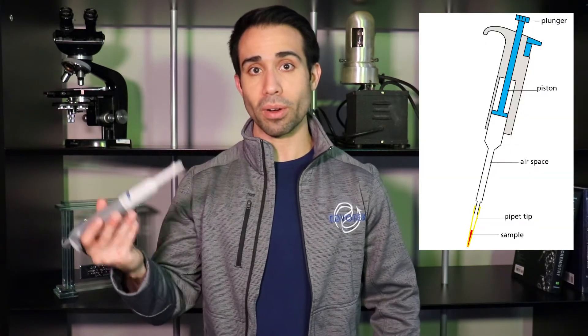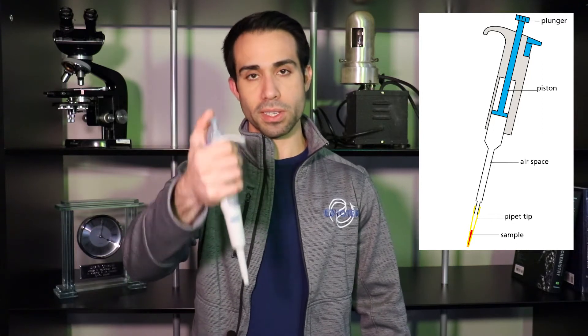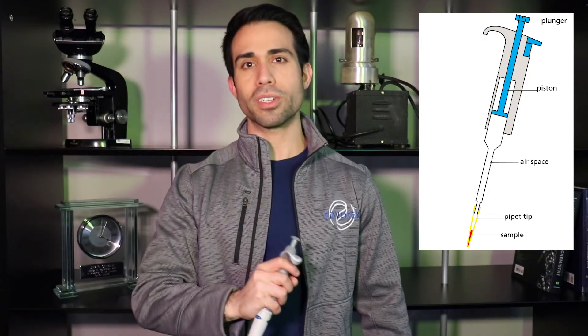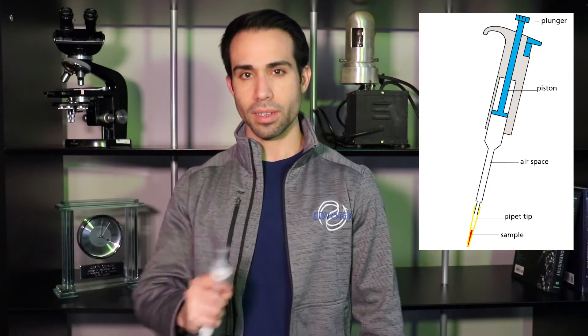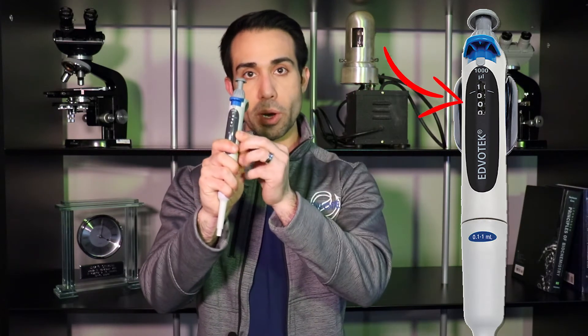A micropipette is similar in almost every regard, the only difference being that the bulb has now been replaced with a plunger. The other major difference is accuracy. On a lab micropipette, you'll notice a dial on top and a numerical readout on the front.